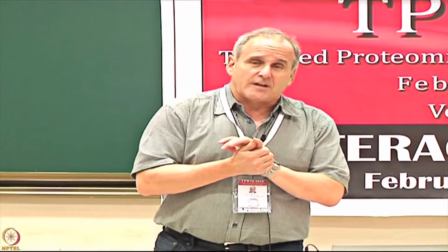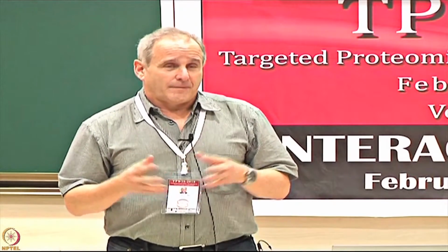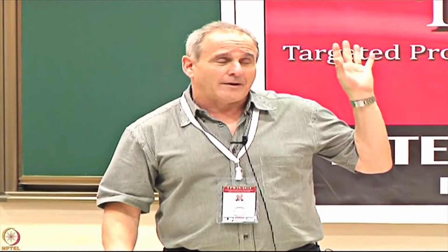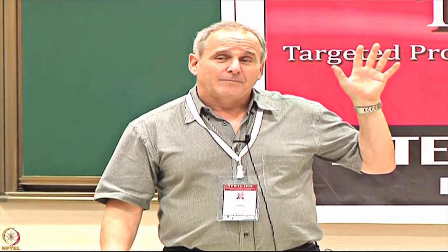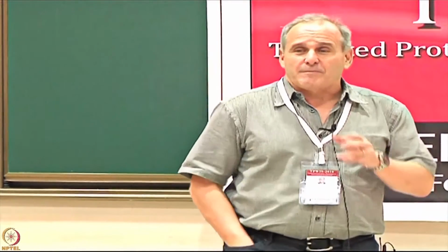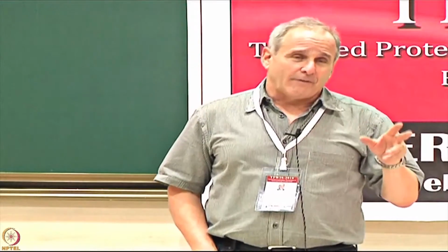So when we begin these studies, we're going to study these days in my lab maybe 15,000 different proteins. That's a pretty good list. Now, attached to that list is a price tag, right? Because by definition, even using NAPPA, to get 15,000 proteins on a slide, we have to do 15,000 DNA mini-preps. And that's a lot of DNA mini-preps. It's certainly easier to do mini-preps than it is to make protein, but it's still a lot of mini-preps. And even if the mini-preps were $2 or $3 American per mini-prep, to do that many mini-preps is nearly $50,000, right? Just to do that number. Not to mention the labor and all the time involved in preparing it.